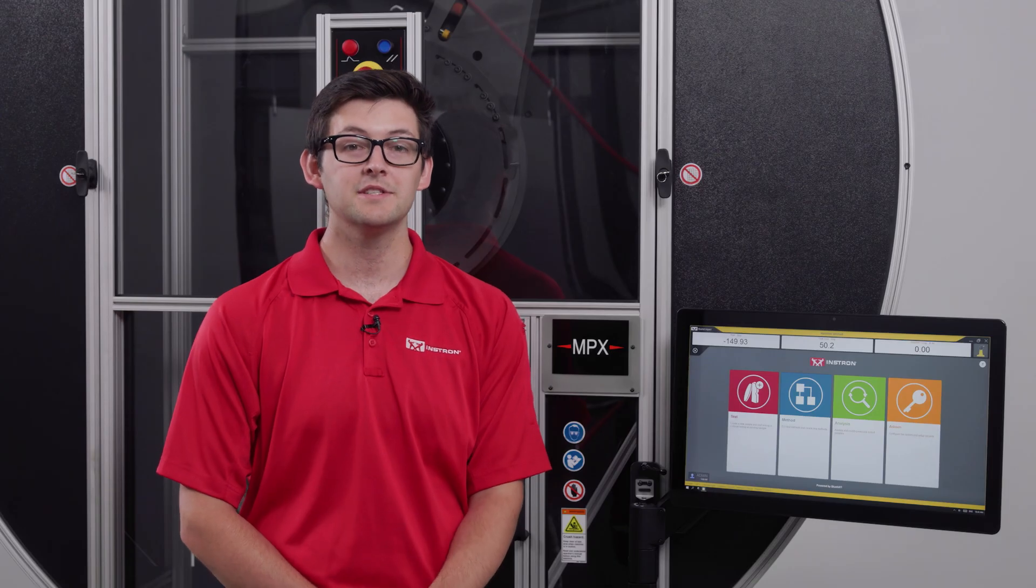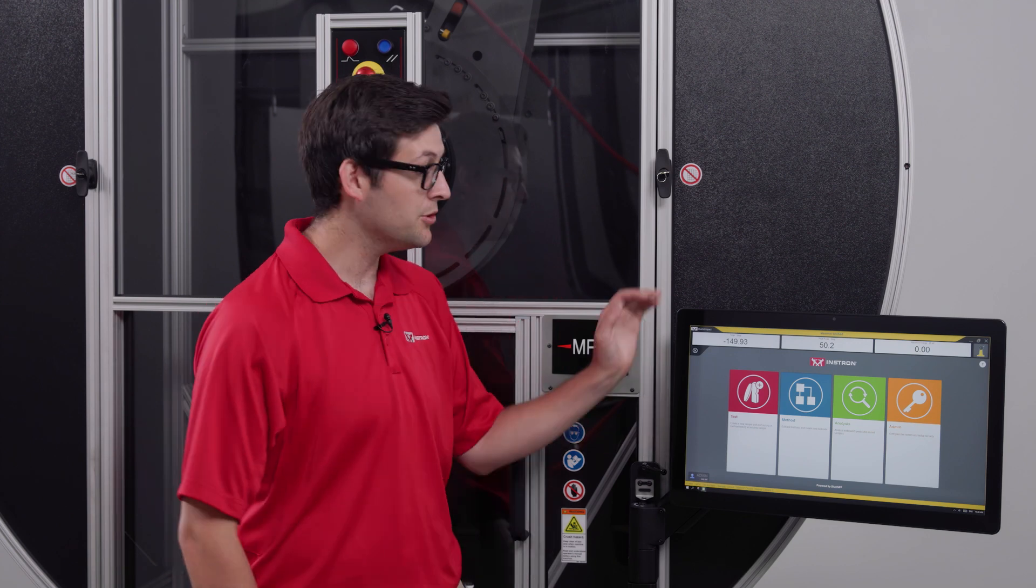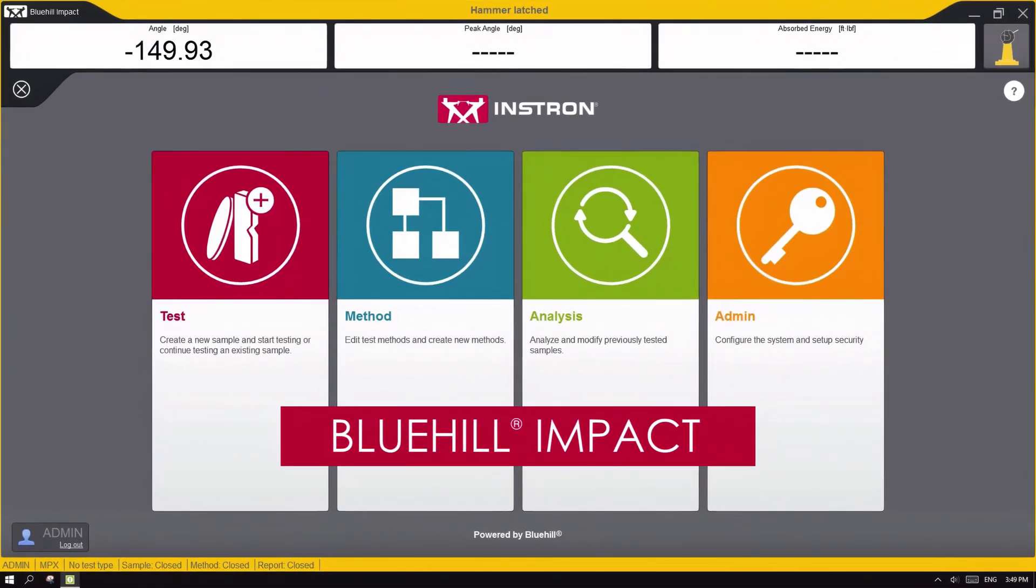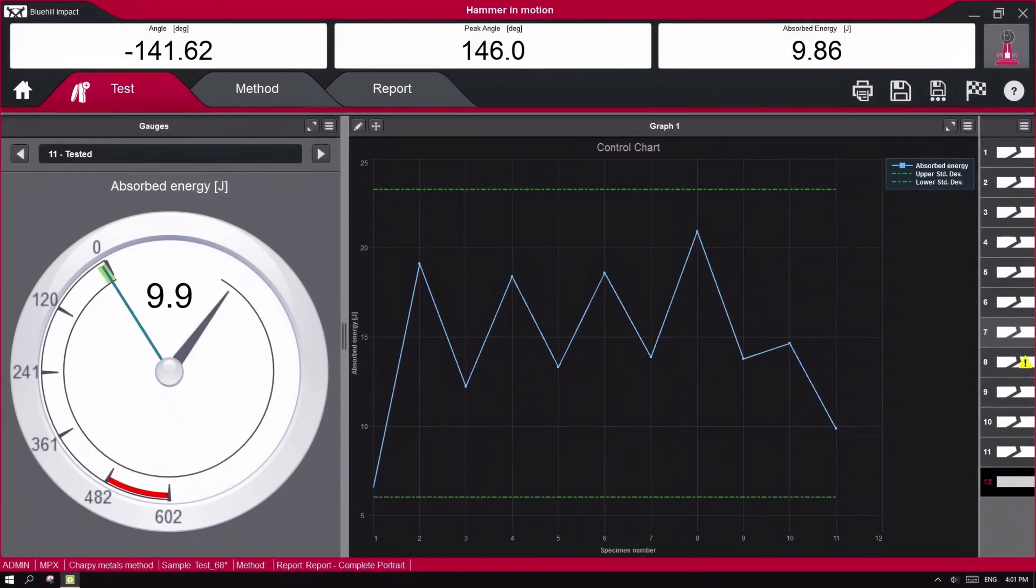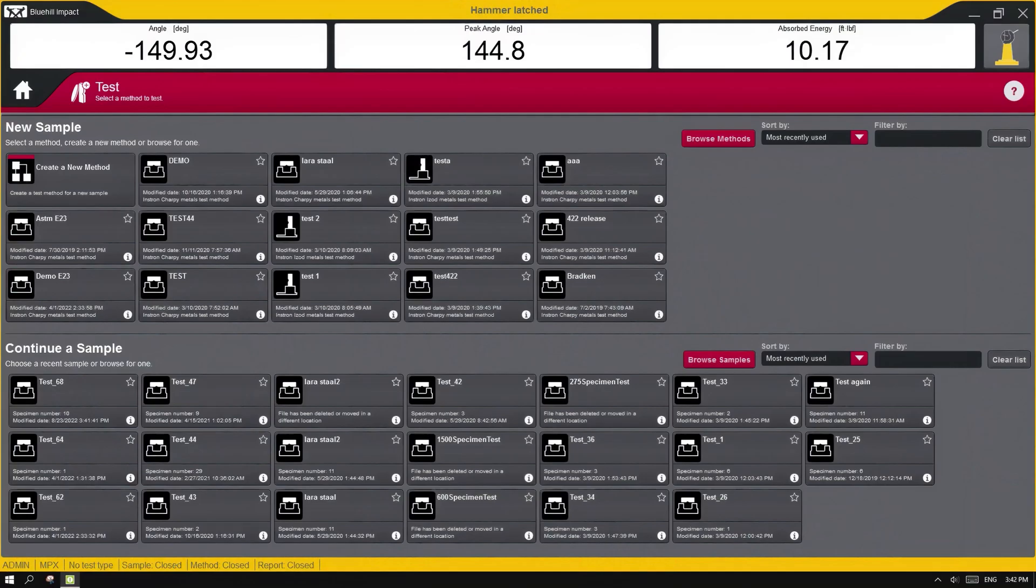Now that we've discussed the overall system, let's take a look at the software. Bluehill Impact is our pendulum impact testing platform designed for touch operation on a dashboard that gets mounted directly to the MPX.